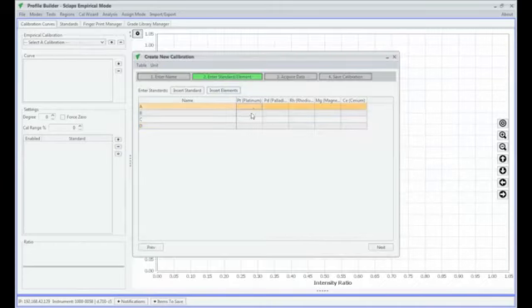And now I can plug in the concentrations of these different elements. I can switch the units from percentage to ppm, and platinum, we have 1882 parts per million in sample A. Sample B has 1981 parts per million. Sample C has 427 parts per million, and sample D has 1356 parts per million. So now I can go through and fill in the rest of these. So I'll do palladium as well with 550. Sample B will have 589 parts per million palladium, and I'll just continue filling out the rest of these elements.